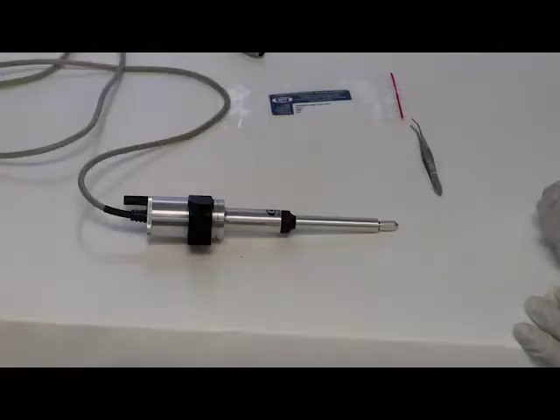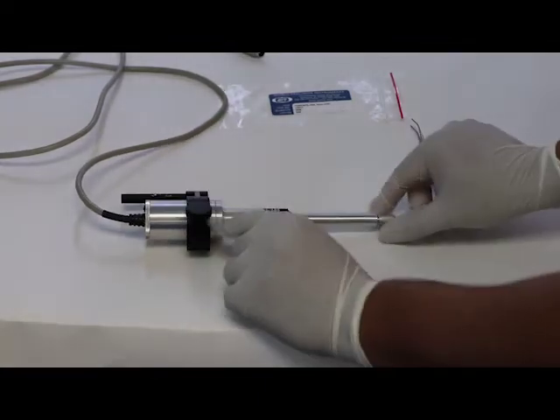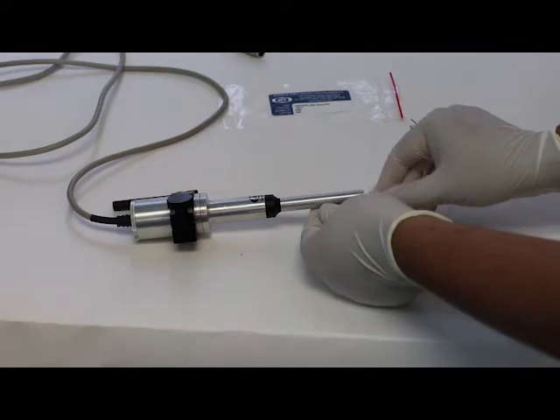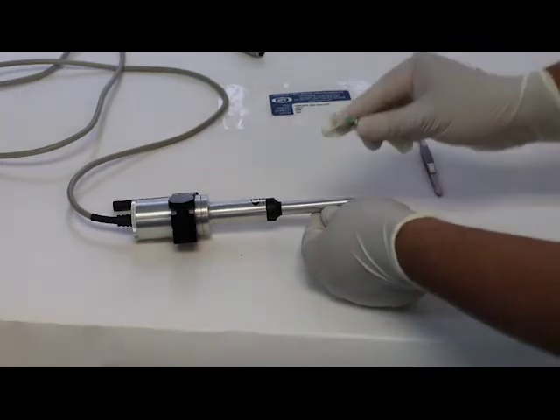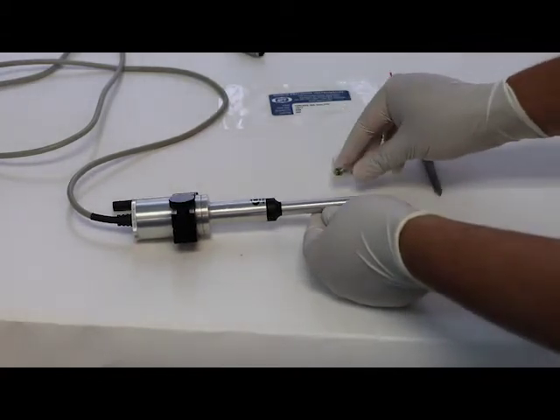Sometimes the gaskets get worn out and we have to replace gaskets to avoid leaks. So now we're going to show you how to remove the gaskets to replace them. The first thing that we do is remove the collet of the injector. As you can see, it comes out with the glass gasket.